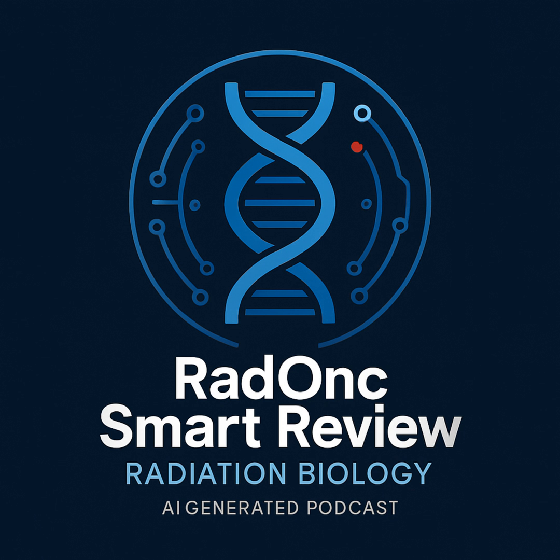Makes sense. And finally, W for Western blot. Detecting protein. What's different here? Okay, target is protein. First, extract proteins from your cells or tissue. A key step is you usually denature the proteins, often by boiling them with SDS, that's sodium dodecyl sulfate. Right. SDS does two things, doesn't it? Unfolds proteins and gives them a negative charge. Exactly. It coats them with a uniform negative charge, so when you run them on a gel, they separate primarily based on their size, not their native charge or shape.